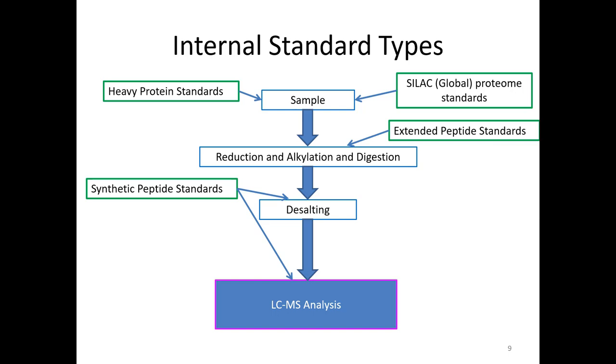And do you know what the variability of this measurement is? It's like 30%. It's not very precise, so already you've got an internal standard that you haven't digested yet. It may not be pure, and the actual concentration you've been given to write on the tube is plus or minus 30%. So this is not great.